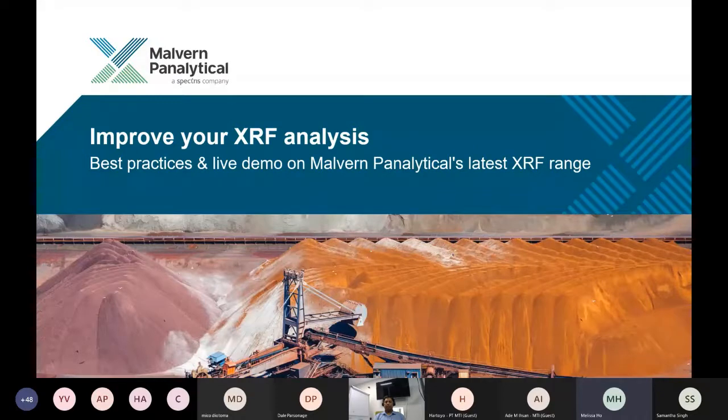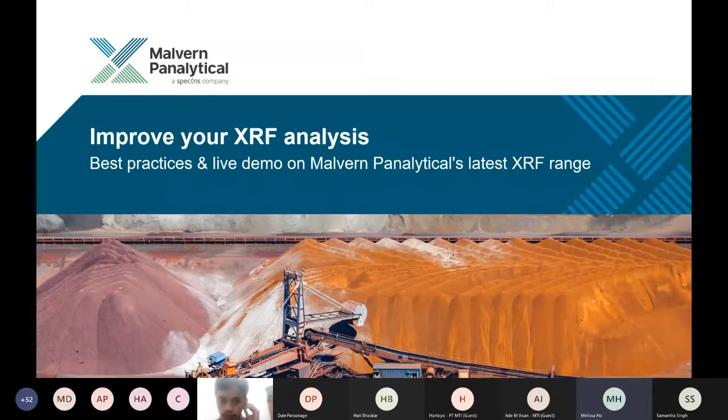So in case you do have questions along the way, these are experts who can help you and advise you, whether it's coming in from reference standards, technologies to use, or even understanding how you can achieve other useful, and also accurate analysis with XRF.